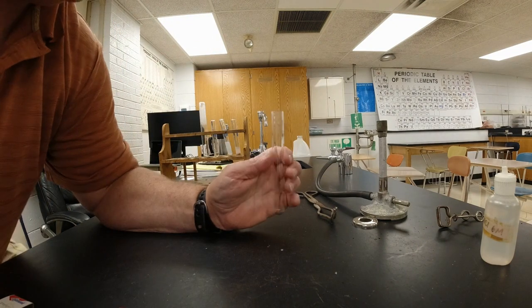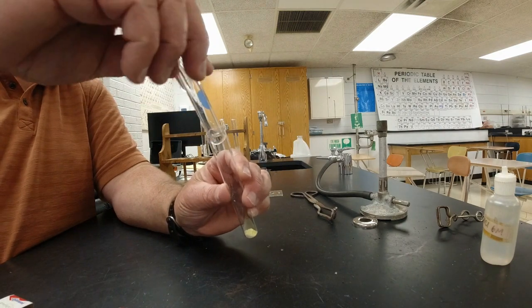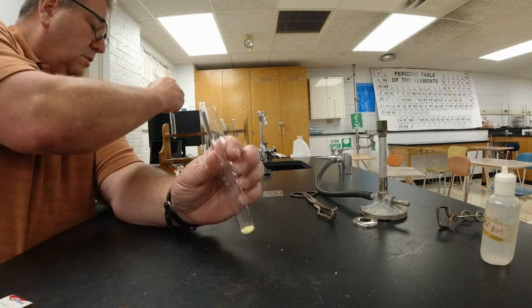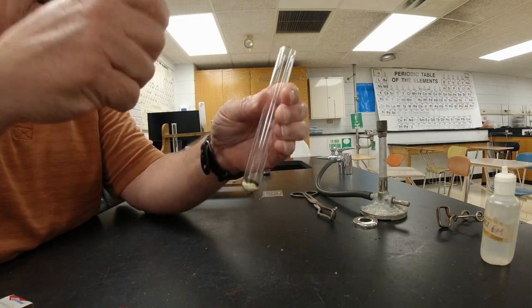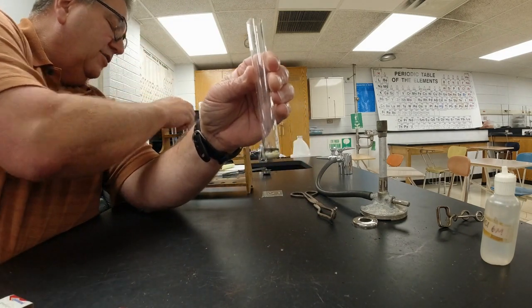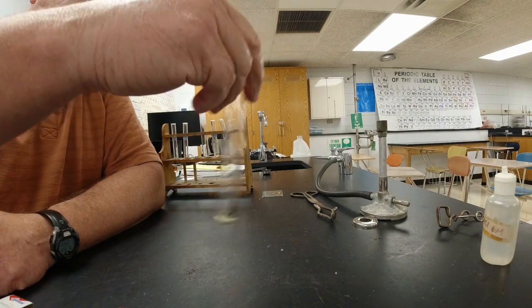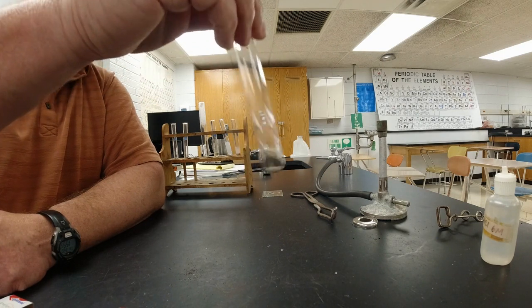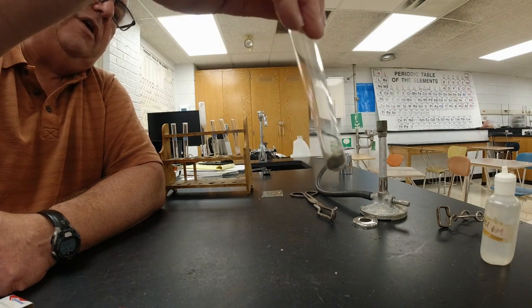So what I'm going to do is pour both of these into a test tube. So there's the sulfur, there's the iron, and I put it in there, and you have a yellow solid and the brownish gray solid iron. If I mix those together, sometimes blending two substances together can give you a different color.